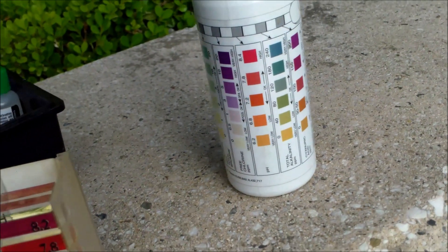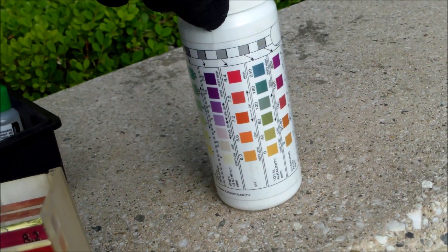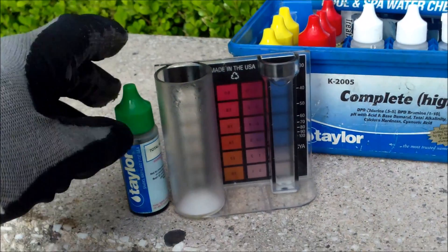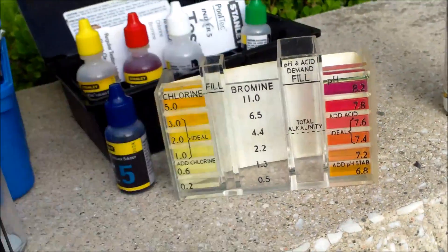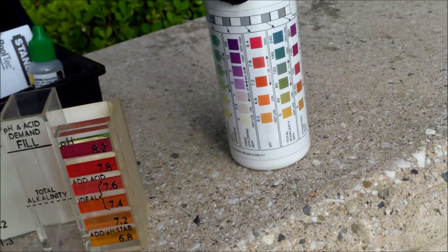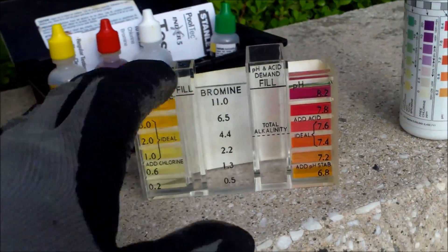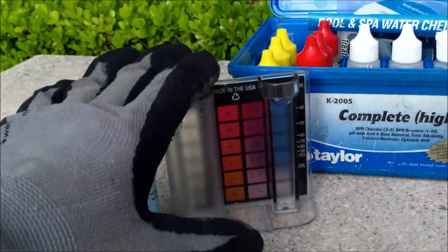The test strip also does a pH test, and I find the pH is actually very accurate on this strip. The K2005 does an alkalinity test, as does the K2006 and the 5-in-1 test kit. The alkalinity test on the AquaCheck is not quite as accurate — it's more of a ballpark figure. I find it useful, but the Taylor test kit's alkalinity reading is excellent.